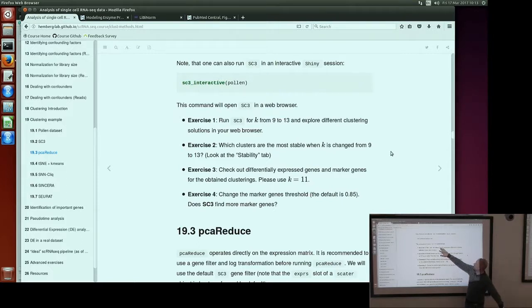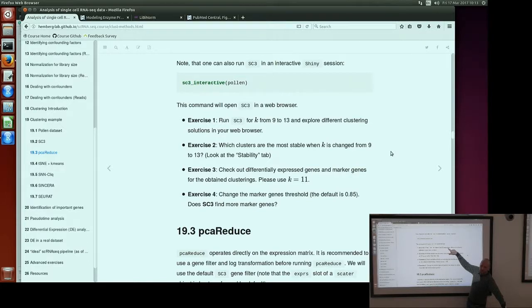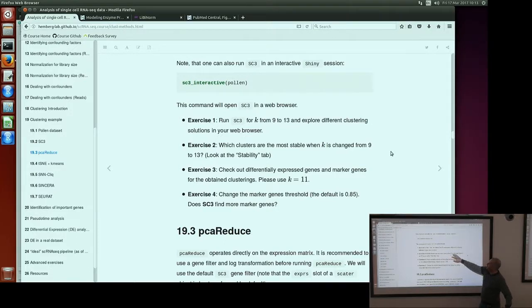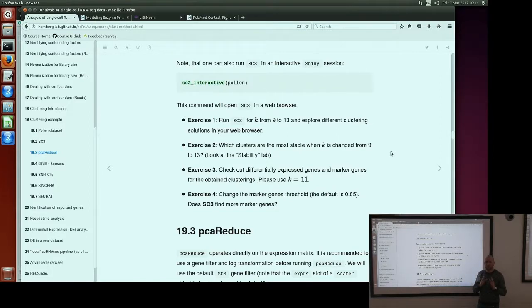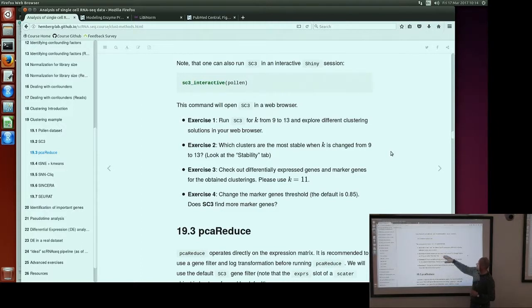When you run SC3 for multiple k values, there will be another tab called stability, which shows which clusters are stable across different k solutions. If you change k from 10 to 11 and your cluster doesn't change, that cluster is reported as stable. You can also check differential expressed genes and marker genes. For the marker gene threshold, by default we use 0.85 from the ROC curve operator — you can change this. We found this from looking at several different single-cell datasets. This would be very strict, but those marker genes will definitely be marker genes. You can make it a bit lower to find more marker genes if you don't find a lot in your dataset.